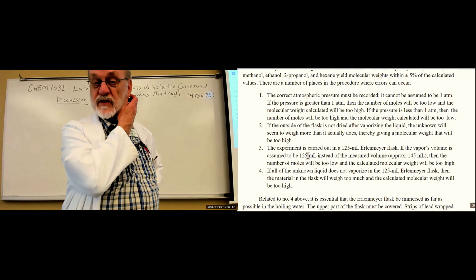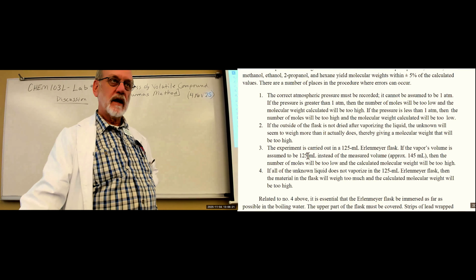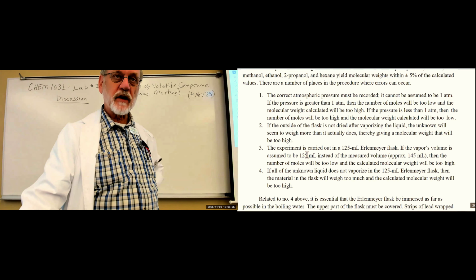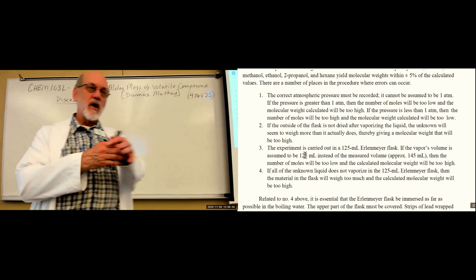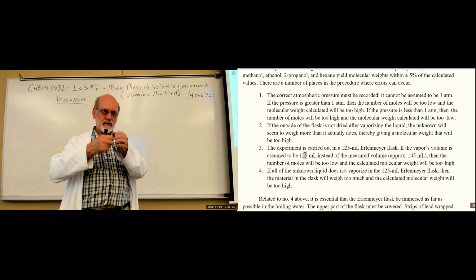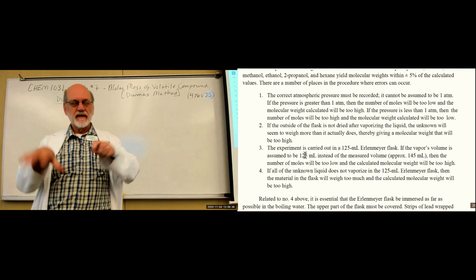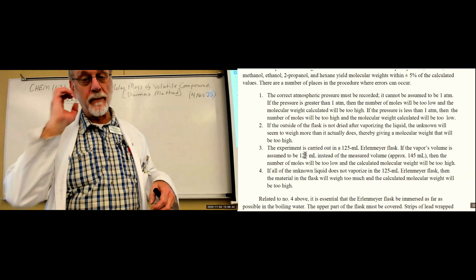You've got to be sure your flask is dry at all times, unless it's in the water. Then once it's out of the water, make sure it's dry. Check for condensation underneath the aluminum. So when you put your small aluminum cap on there, be sure that copper is nice and tight, holding it, sealing it. And then you'll cover the whole thing with a big aluminum cap.